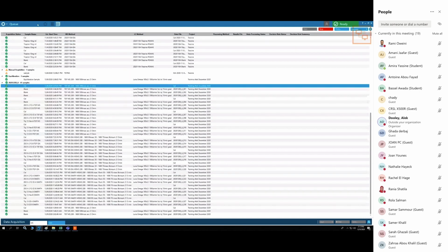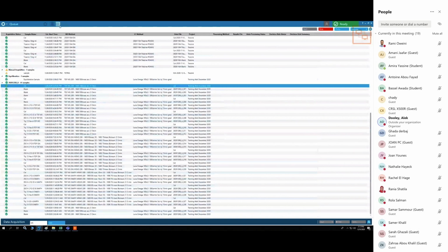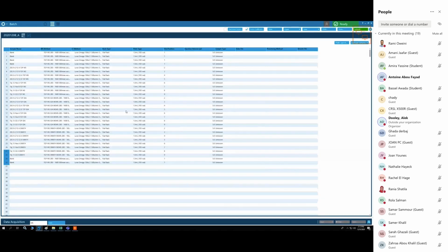Okay, so that I think is a good overview because we went quite fast yesterday in the batch and the queue. Any questions? All right, so we went so fast yesterday that we did. Oh, yes, please.